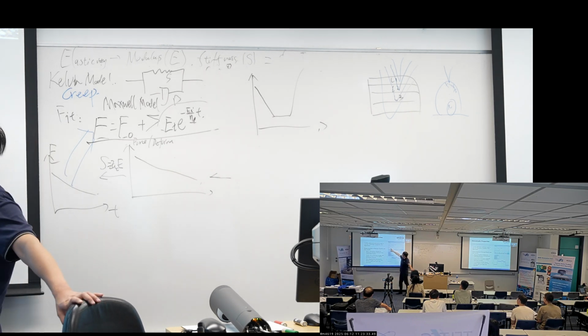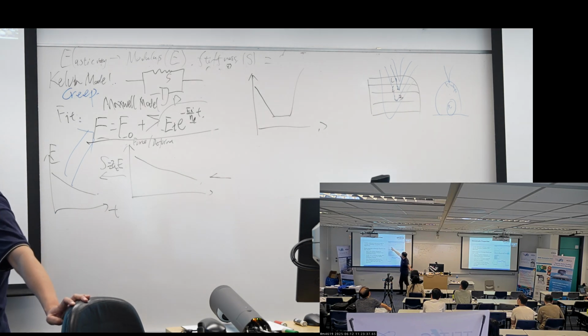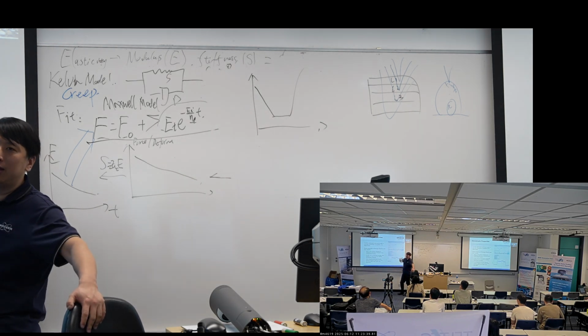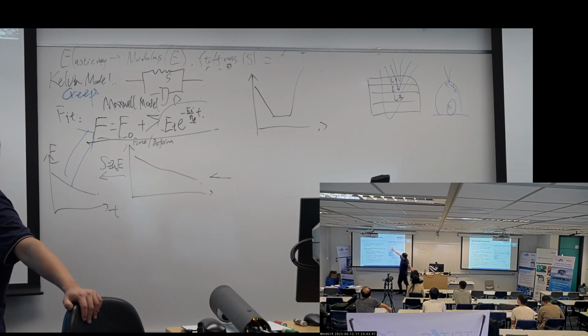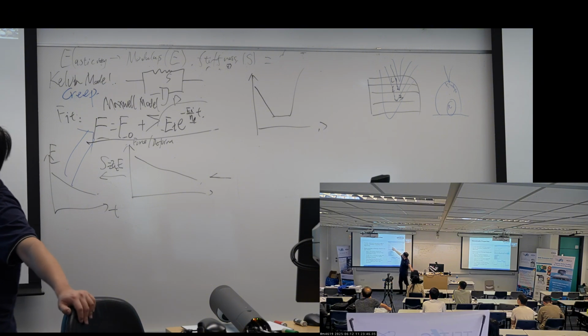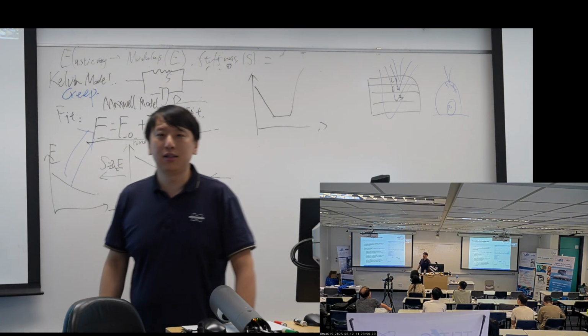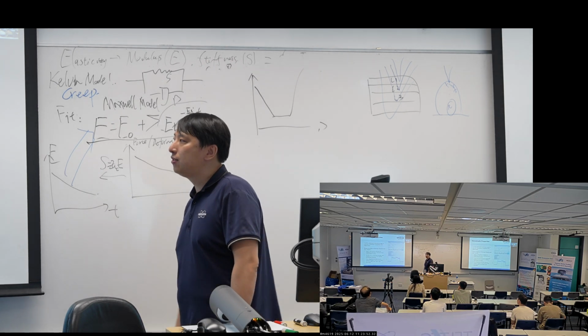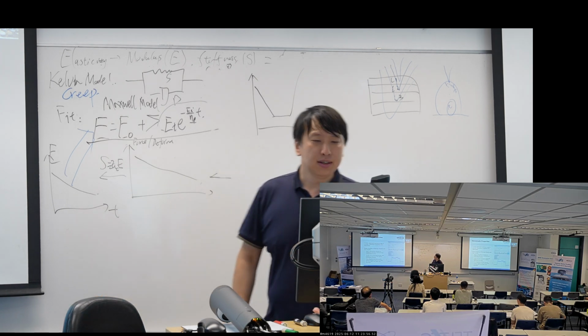The fourth one is moving down directly. I define a length I want to move down, regardless of the force. The fifth one is moving up, regardless of the force. And the sixth one is I hold the Z, and I can choose hold Z or hold Z sensor.